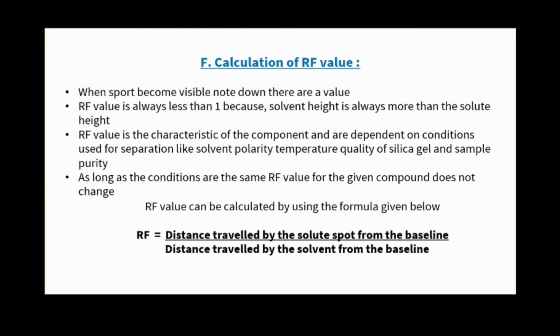Okay, so here is the formula for RF value calculation. The formula is distance traveled by the solute spot from the baseline divided by distance traveled by the solvent from the baseline. Okay, from this formula we get the RF value for each component. Okay, in this way we will perform our TLC.